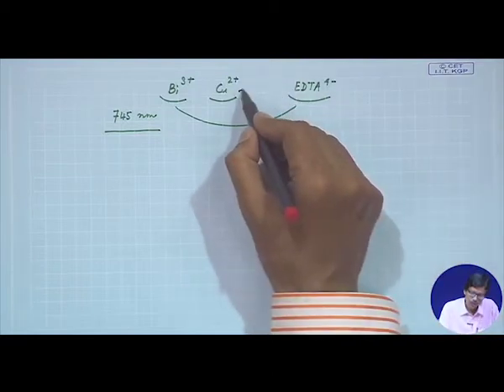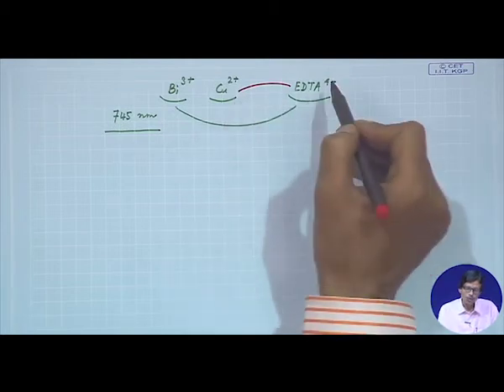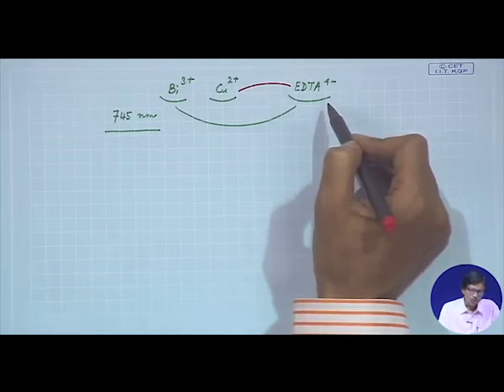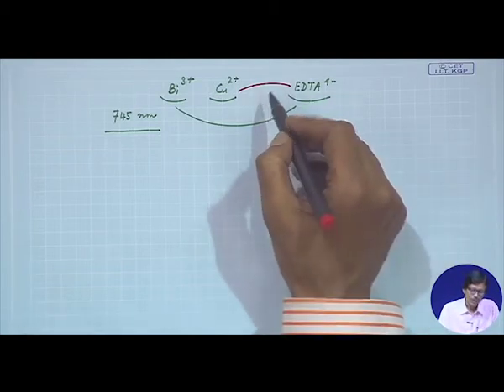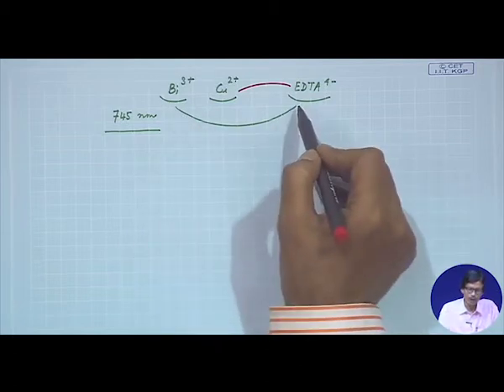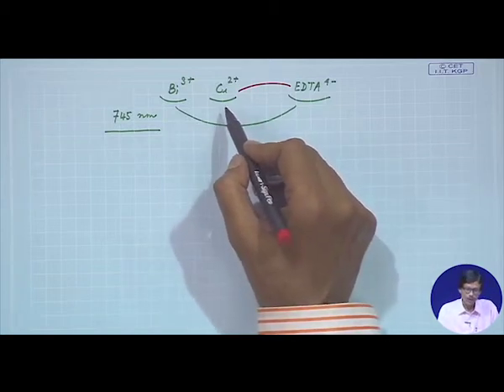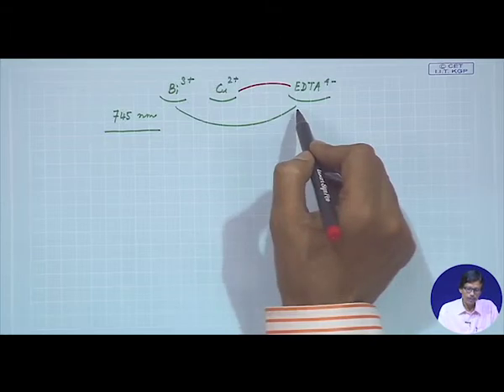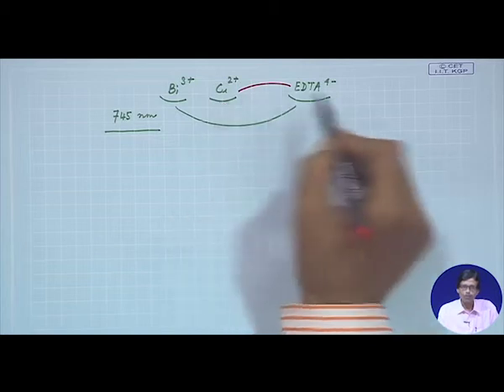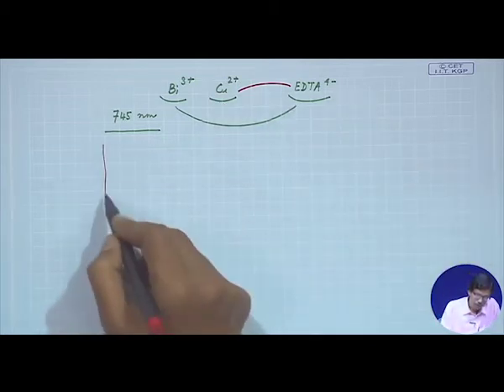So, what are we looking for? We are looking for the corresponding complexation of copper 2 plus and EDTA. We all know very nicely that a 1:1 complexation reaction goes very well, so we will detect that particular one. When the bismuth is getting exhausted, like your metal ion M1, we get some slope of the corresponding absorbance plot. Then when all the bismuth has been consumed, we get the complexation reaction between copper 2 plus and EDTA.